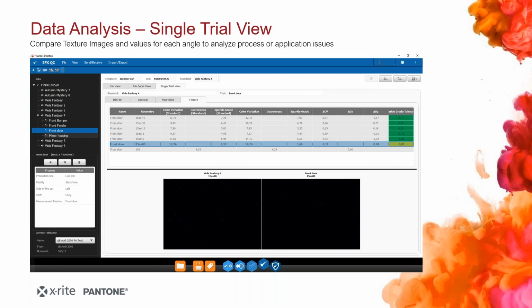So everything here now is under control, and the good thing about it is we can also select or bring those images into our report function into Excel, which is available on the top left side. Below the file menu, you can just export it into an Excel file for reporting purposes, and you will have those data.